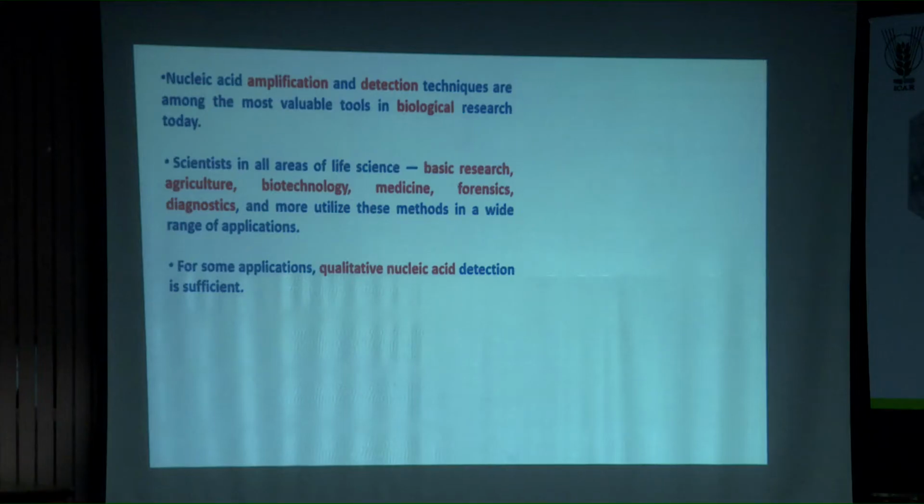That is one thing. The second thing is, of course, you got some amplicons. Can you tell how much amplicon is there in terms of copies? Of course, you can elute that amplicon and go for some kind of quantitation, but you cannot tell how many copies of the target are there in that particular amplicon. I hope you understand what I'm emphasizing here. It's impossible in the case of conventional PCR. There are many applications where we need to quantitate how much of the target is there in the PCR product. That is possible only in the case of qPCR experiments.